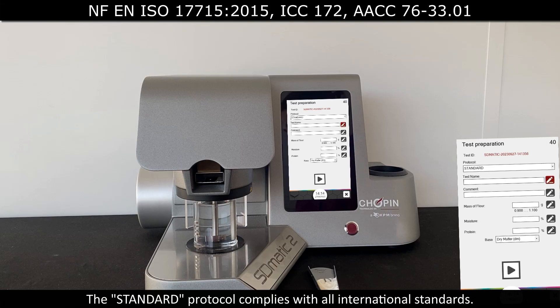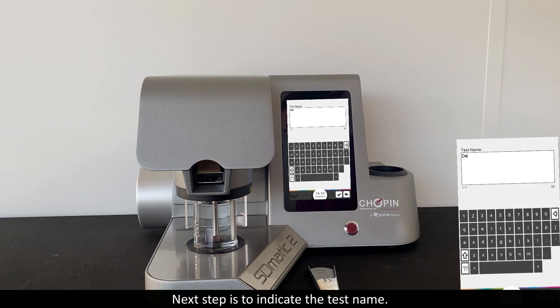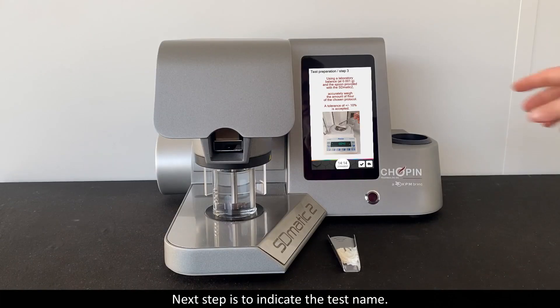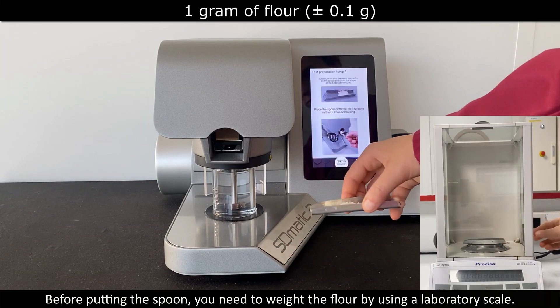The standard protocol complies with all international standards. The next step is to indicate the test name. Before putting the spoon in, you need to weigh the flour by using a laboratory scale.